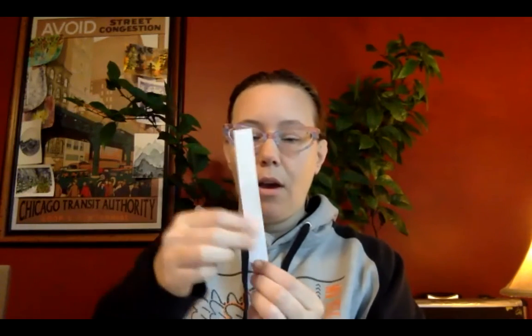I suppose it just depends on the quality of the towel. My problem was when I used the paper towel, I'll show you, it did so much absorbing that it really didn't let the molecules separate out. Basically, the pores of the paper are meant to trap particular sizes, and it works on diffusion. We're going to put a little pigment on the bottom of the paper.